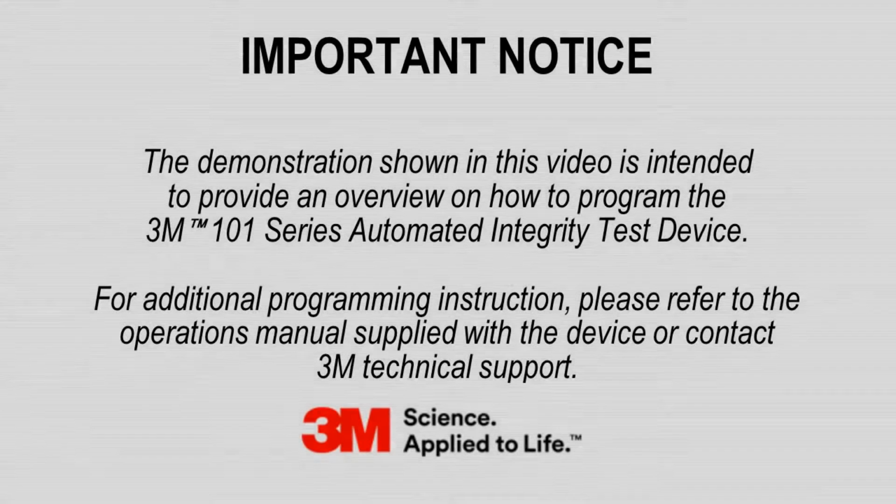Important notice. The demonstration shown in this video is intended to provide an overview on how to program the 3M 101 series automated integrity test device. For additional programming instruction, please refer to the operations manual supplied with the device or contact 3M Technical Support.